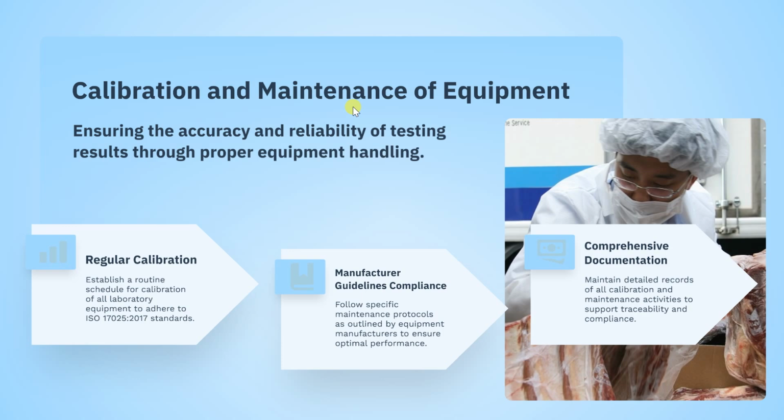That's obvious. Regular calibration helps us to establish a routine schedule for calibration of all laboratory equipment to adhere to ISO standard 17025. Apart from regular calibration, we also have manufacturer guidelines compliance. We have to follow the guidelines listed in the equipment manual on how to calibrate or maintain the equipment in this particular way. Now, comprehensive documentation maintains detailed records of all calibration and maintenance activities to support traceability and compliance.